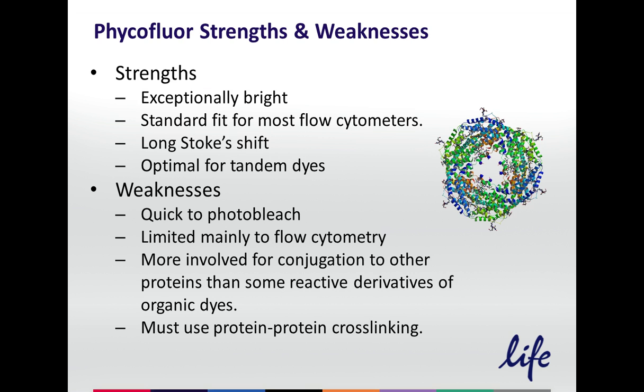But what are the strengths and weaknesses? So I've mentioned the strengths are that Phycofluors are exceptionally bright. They're a good fit for most flow cytometers. For instance, RPE you can excite at 488 or 546, and most flow cytometers will have a 488 laser line. They have that long Stokes shift, so you can do more multiplexing, which is especially important for flow cytometry. And they're good for those tandem dyes.